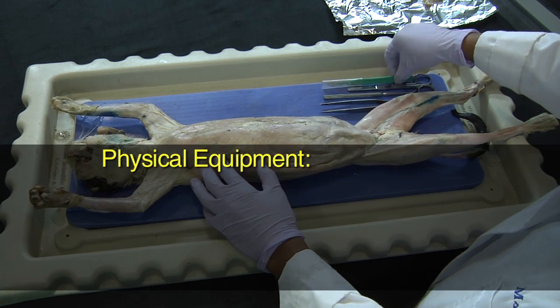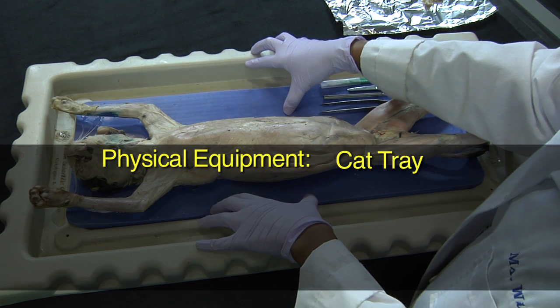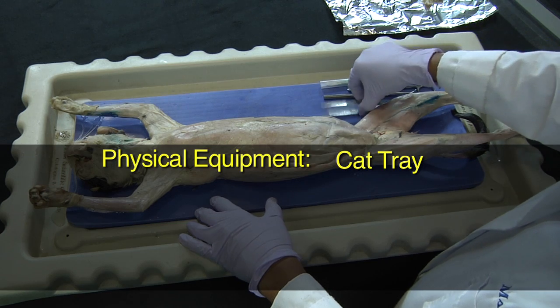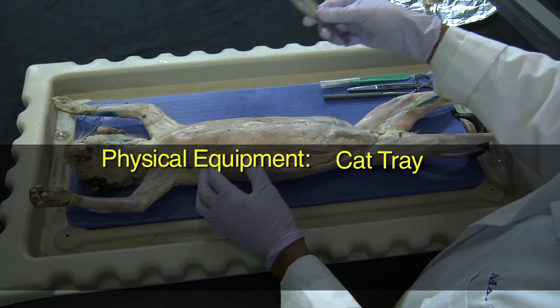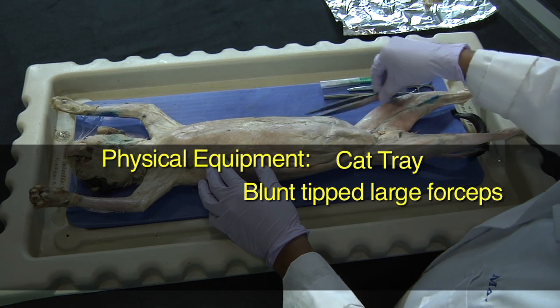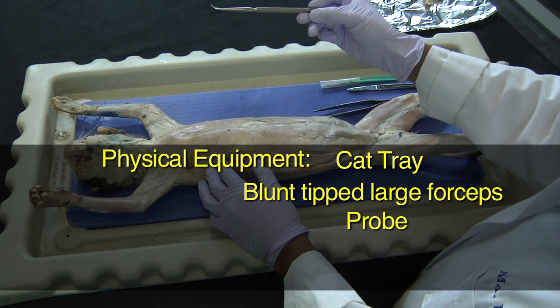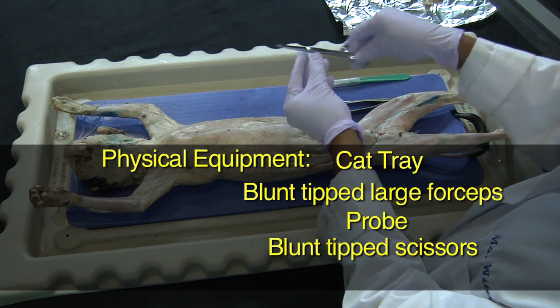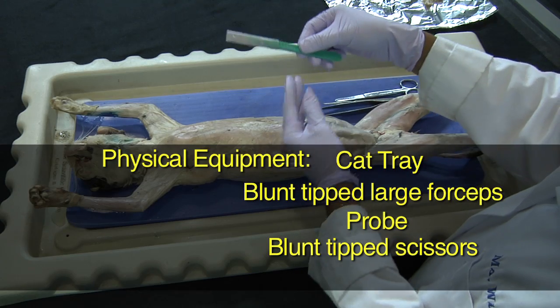In terms of physical equipment, there is obviously the cat tray where the cat will be laying. The utensils that will be used include a blunt-tipped large forceps, a probe, blunt-tipped scissors, and a scalpel.